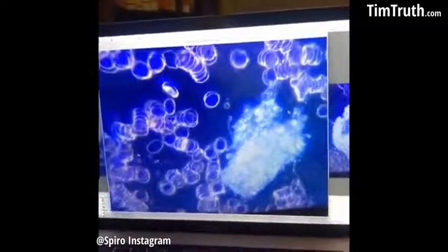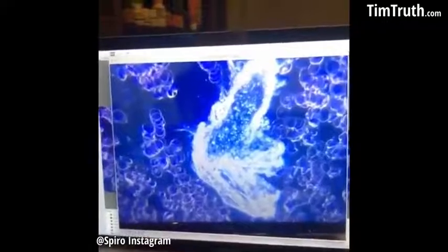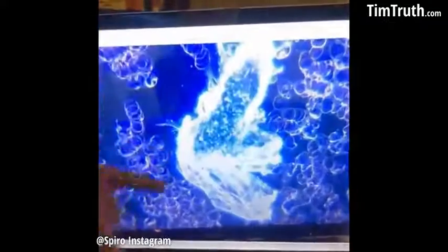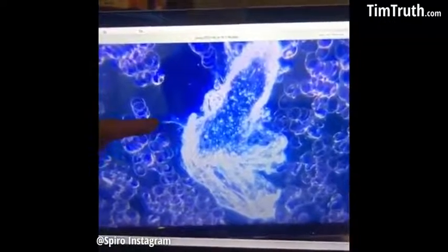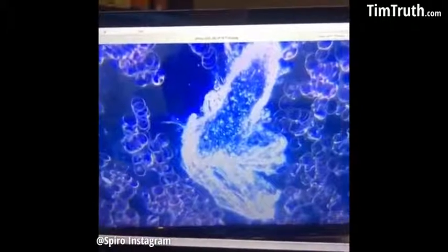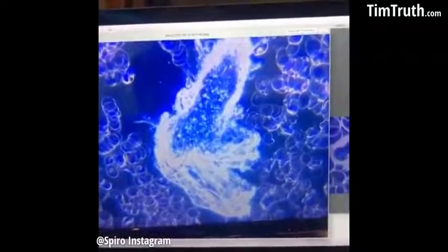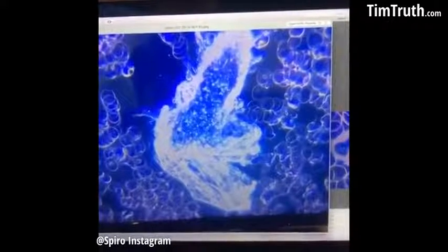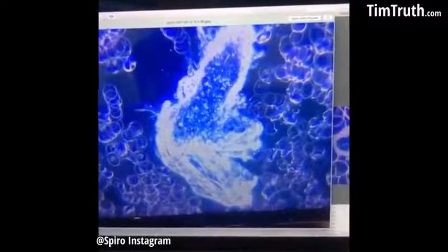So let's look at the next one and try to get through this. What are we looking at here? Here again, the blood cells are coagulated, and also again there is something in the blood. It has again these things here on the side. Very similar. I can only think that must be graphene oxide. Must be graphene. Well, Dr. Young has unequivocally proved that it was graphene. It is graphene in the blood. Yeah, I think so. But we've only got microscopy to work with right now.